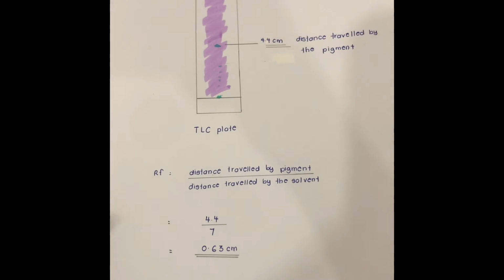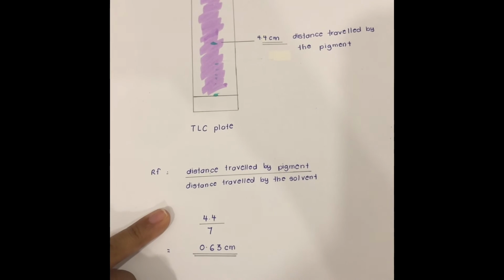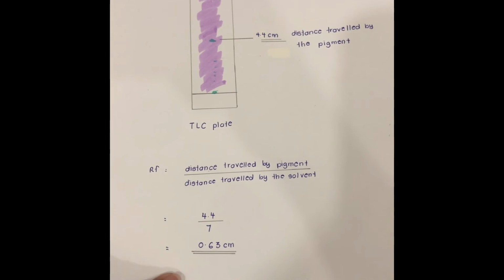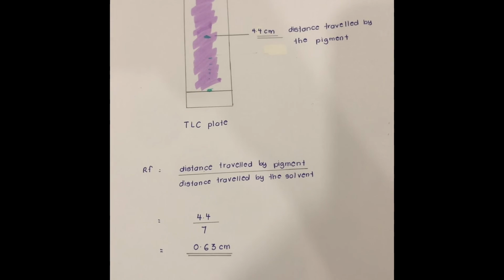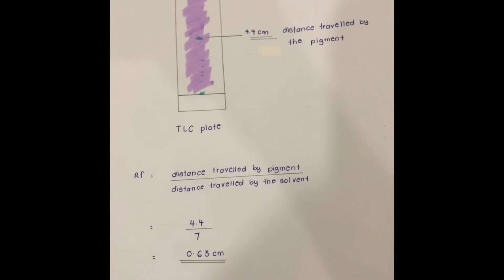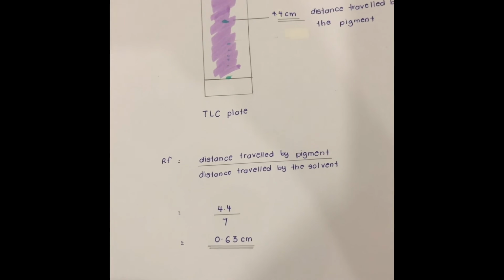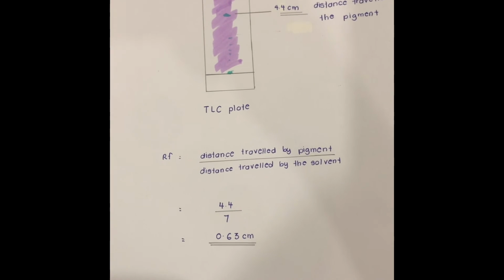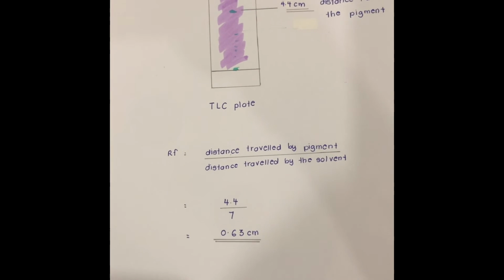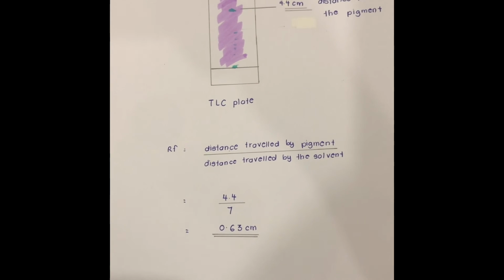So the RF formula would be distance traveled by the pigment over the distance traveled by the solvent. So dividing it, I would get 0.63. So normally, RF values are given a range due to the fact that the components of the solvent mixture evaporate at different rates. So the solvent mixture that we might use sometimes might be slightly different in proportions to other times when chromatography is carried out.